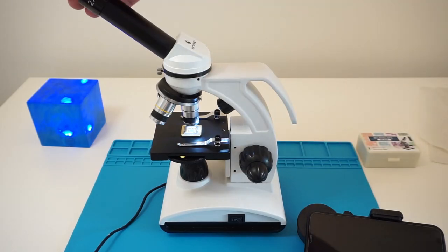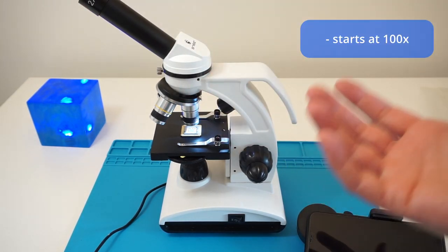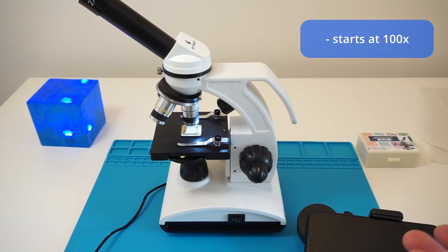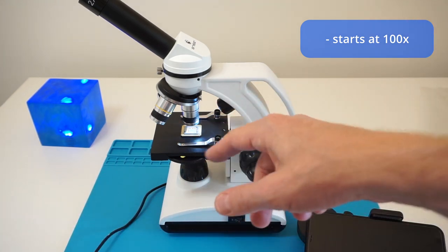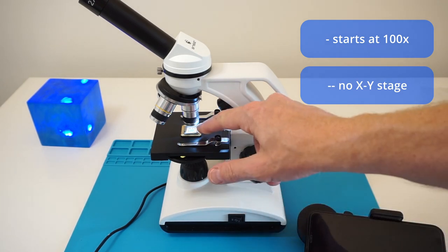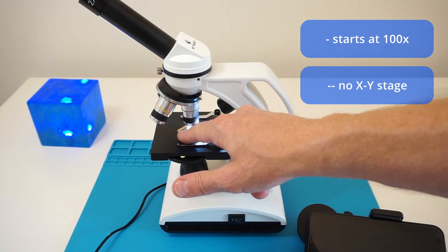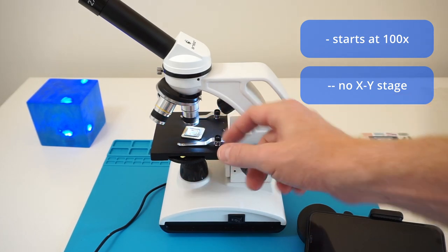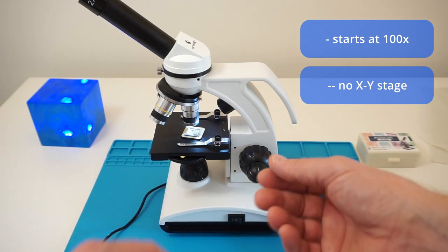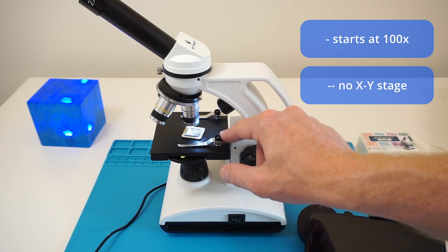It has a starting magnification of 25 times 4, which is 100, which is my first drawback of the system. It would be nice to start at something like 25 or 50, so you get a better overview of the CPU die. The second drawback is, if you want to navigate and see areas of the CPU, you want to move the object, and you have to do that manually, and that's cumbersome and not very accurate. That really needs a workaround.